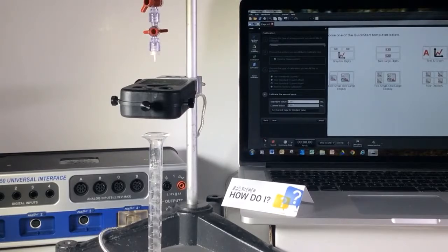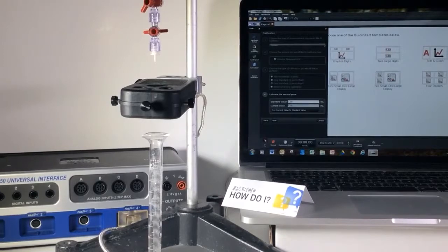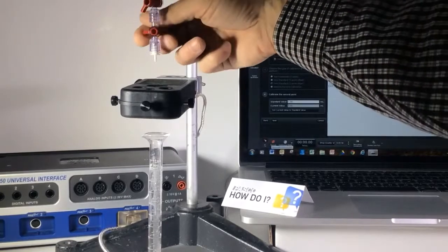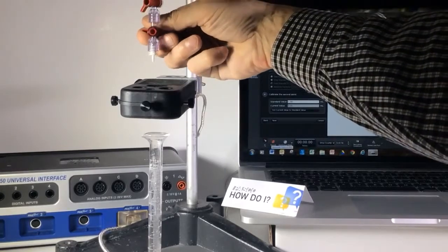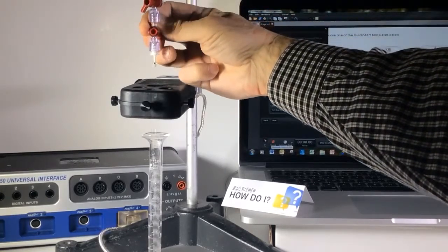In this menu it's showing standard value and current value. I'm going to pause here for a moment and turn on my drops.